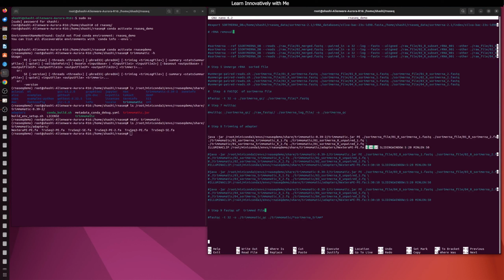is 3, 30 and 10, and these are the Trimmomatic options specifying the adapter sequence to be removed. 3 is the seed mismatch value, 30 is the palindrome clip threshold, and 10 is the simple clip threshold. And SLIDINGWINDOW is a Trimmomatic option specifying the sliding window trimming parameters. This trims the read once the average quality within the window falls below 20, scanning the read with a 5-base wide window, cutting when the average quality per base drops below 20. And MINLEN 50 is a Trimmomatic option specifying the minimum length a read must be to be kept. Reads shorter than 50 bases after trimming are discarded.